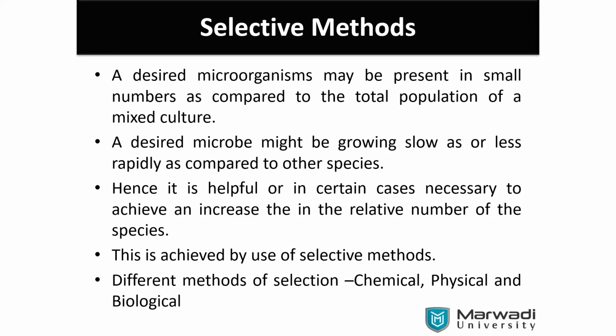This one is very good. It's a beauty even. Microbial beauty. It is a swarming growth. Earlier, you told me about different characters, right? So it had started to grow and spread. Any characteristics, we are just looking for the characteristics. How the organisms are growing. Some are here, you can see it is swarm growth. Okay, there is a growth in a continuous pattern.